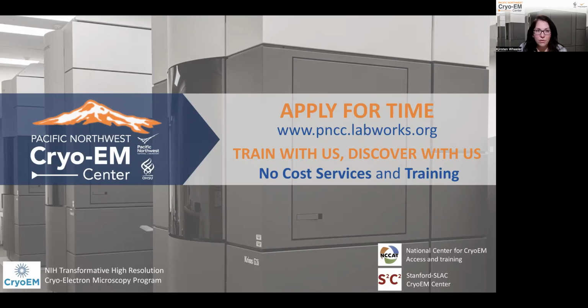PNCC has 5 microscopes. We have an Arctica with K3 camera for screening and 4 Krios instruments for data collection equipped with K3 and Falcon 4i cameras. 3 of our Krioses are equipped with Gatan energy filters. For sample preparation, we have 2 Vitrobots, a Leica GP2, and a Vitrojet undergoing validation before offered to users.